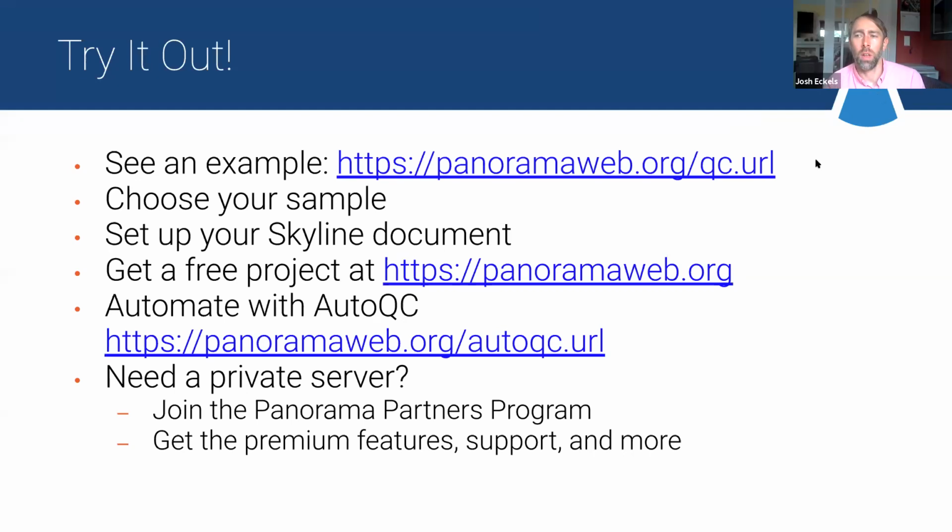Right. And I think the other benefit to this approach, in addition to what you said, Lindsay, is that the metrics we're tracking tend to be a little more actionable. For example, if retention time shifted, that's probably a column issue, as opposed to, oh, my IDs dropped by 50%. That doesn't really tell me where the problem is. Obviously it is a problem, but it's less diagnostic of what the root cause might be.